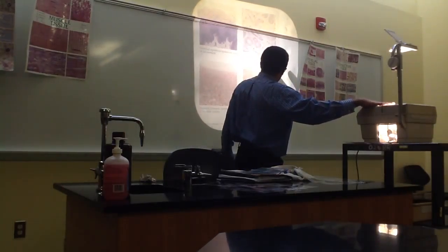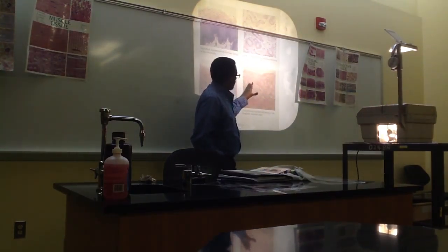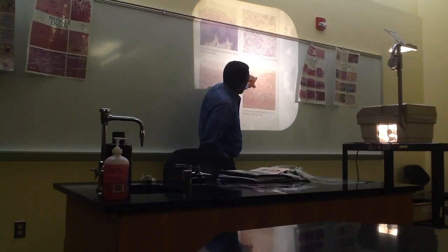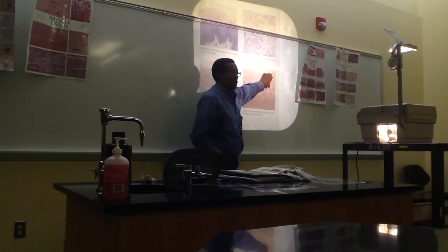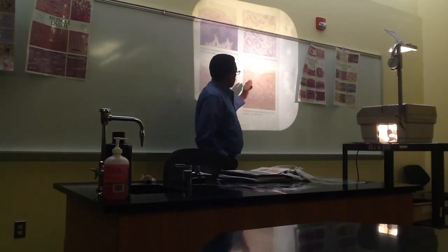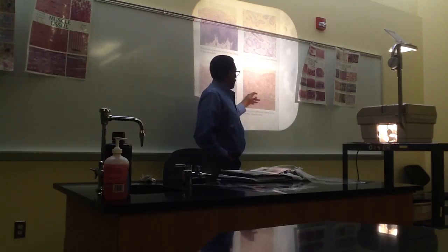transitional epithelium. So the best way to identify transitional epithelium is I will try to show you a section where the cells near the free space look like they have a very thick cytoplasm, like this. See how thick this looks, and how thick that looks, the way that it stains? Well, you find this transitional epithelium, for example, in the urinary bladder.